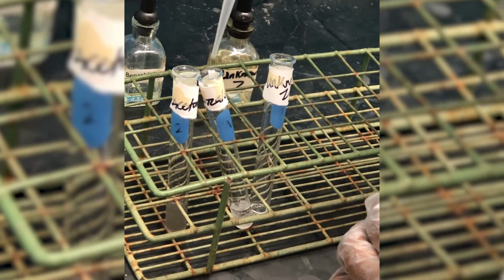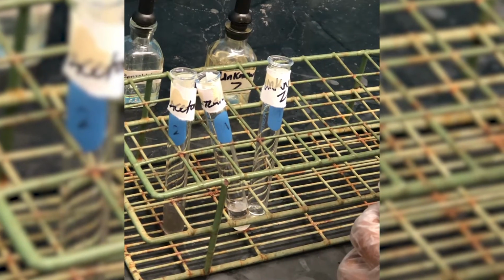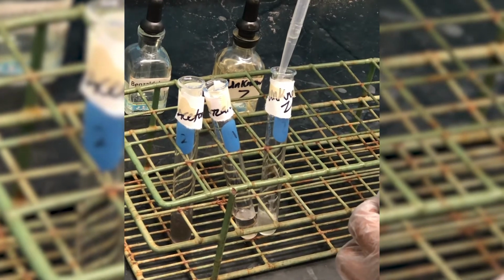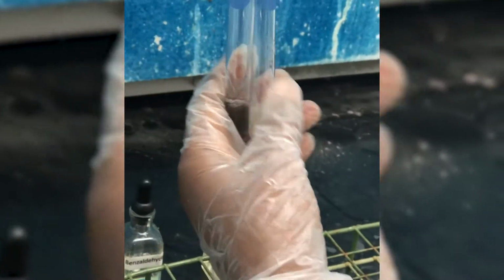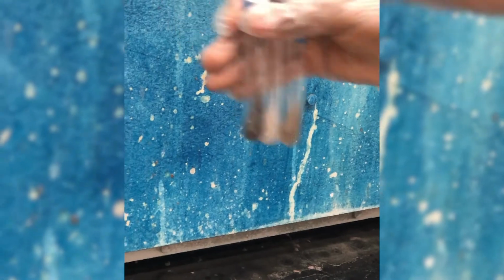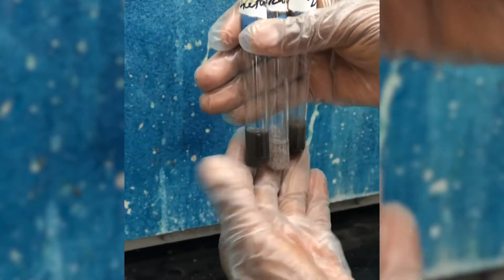into benzaldehyde and 2 ml into our unknown. 2 ml of Tollens reagent. Supposed to shake the samples, make sure they mix, and then put them in 60 degrees temperature water for 5 minutes.